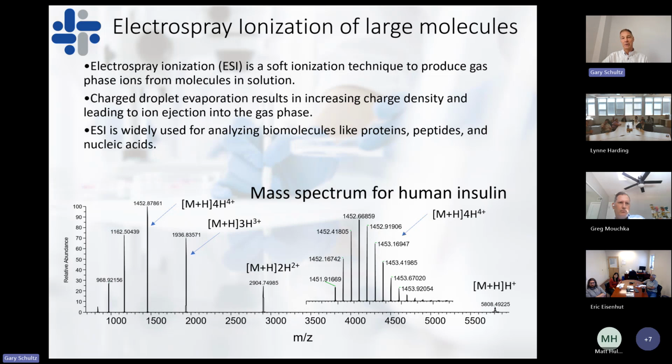And the only way that we could achieve that performance was to use an affinity capture at the protein level and affinity capture at the peptide level. So really the main driver to using multi-dimensional chromatography in combination with mass spectrometry is the assay sensitivity requirements.